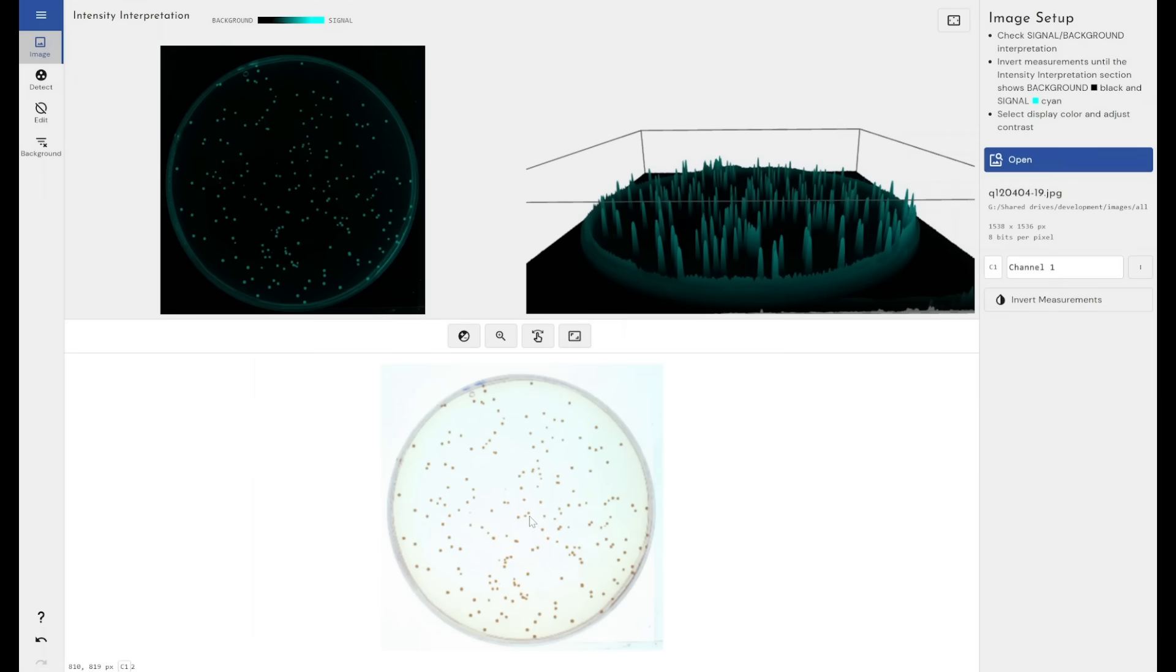At the bottom here, we can see the current image view. This is the way the image has been brought in. We've got all of the options available to us in terms of image adjustments that we have within the other Phoretix modules.